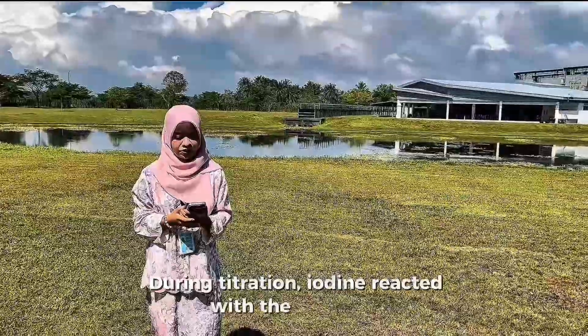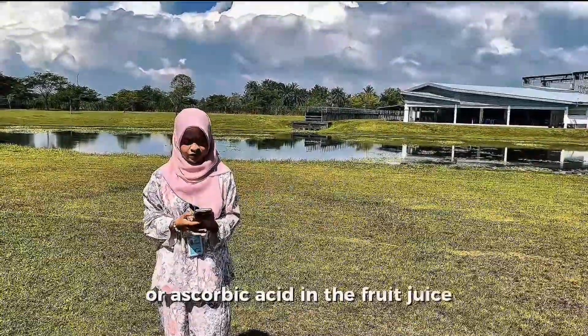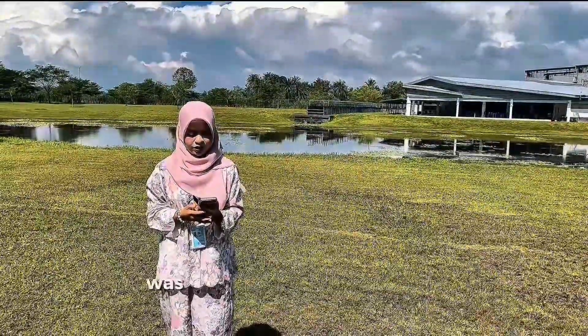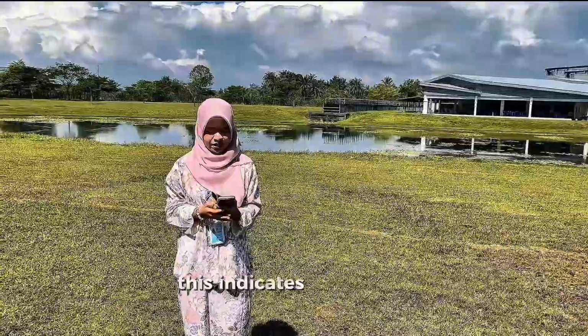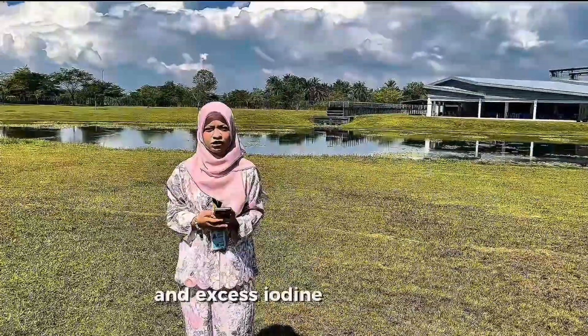Titration: iodine reacted with the vitamin C, or ascorbic acid, in the fruit juice. The endpoint was reached when a permanent blue-black color appeared after the addition of starch indicator and remained for about 30 seconds. This indicates that all the vitamin C has reacted and excess iodine was present.